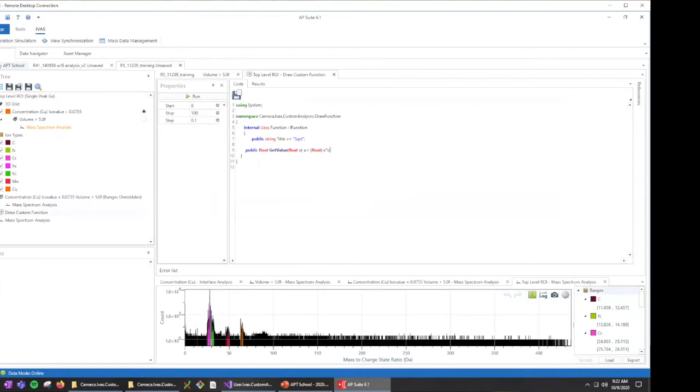And that illustrates why it's a module and not built in; it's not super tightly coupled to the shell.